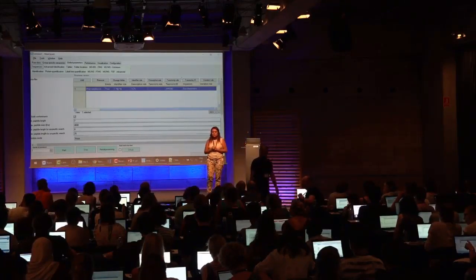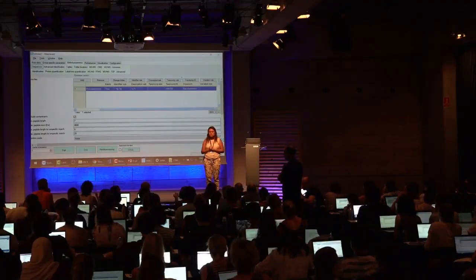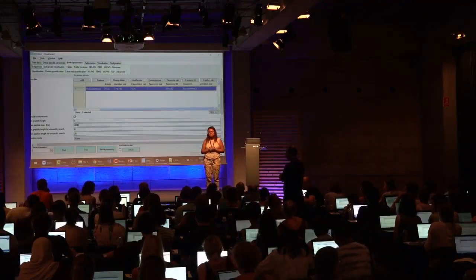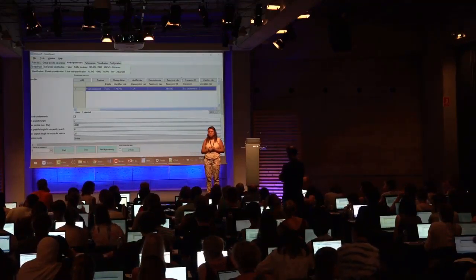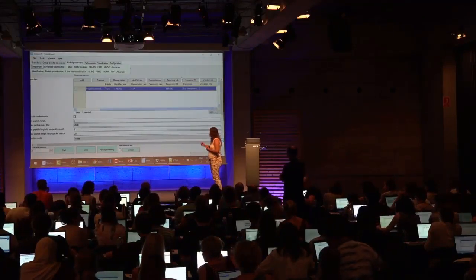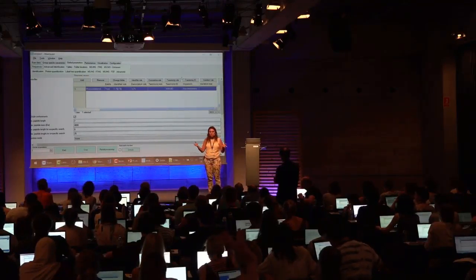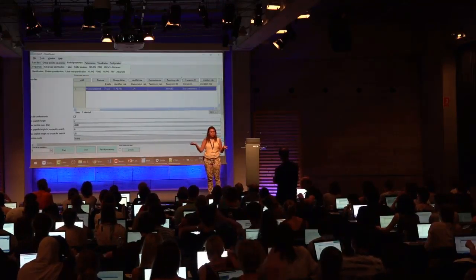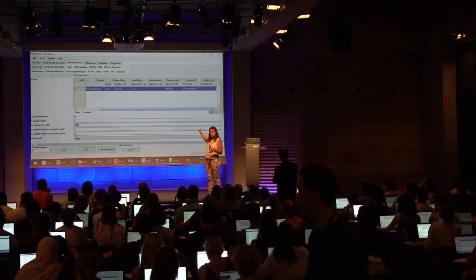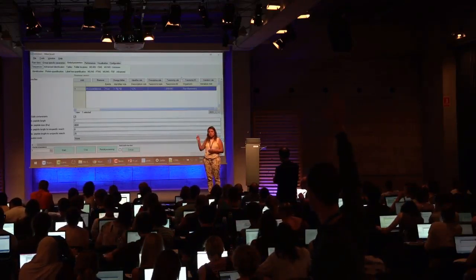Hi, I have one question regarding the organism. If you are working, for example, with green plants, because your species of interest is poorly sequenced, is there any way to indicate in the protein groups the different organisms of these proteins? The taxonomy ID will help, and then later you will have the table information, and then you could work on parsers to get more of the result. That's why the taxonomy ID is important when you have more species in your search. Okay, you could define it here.